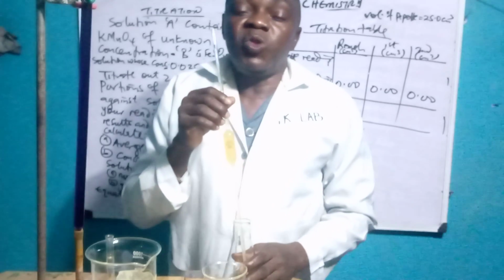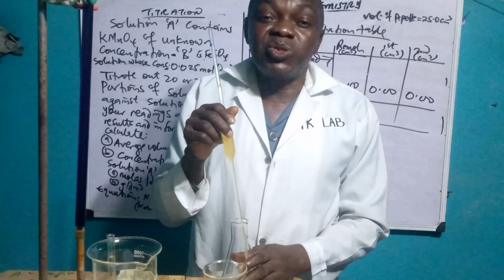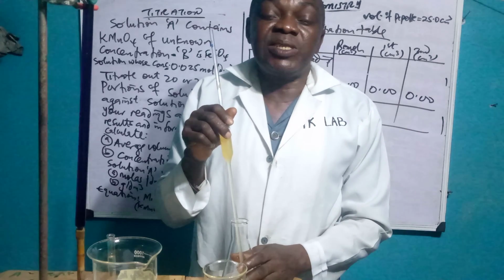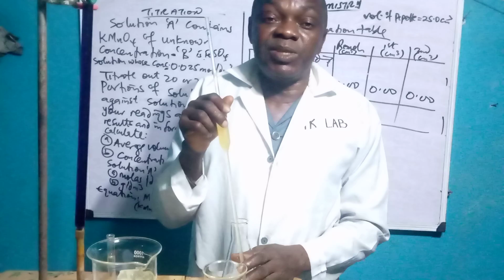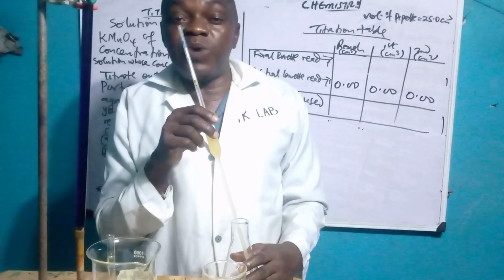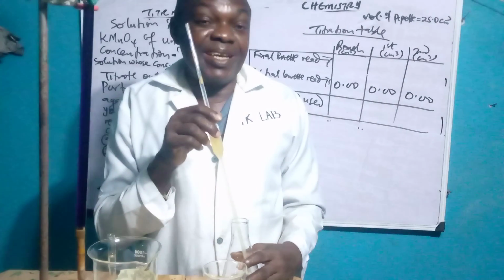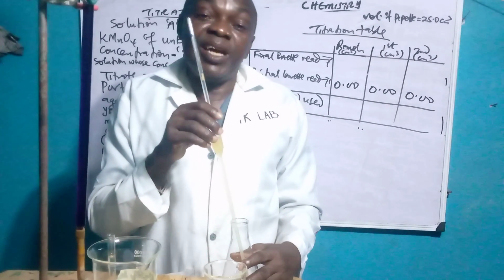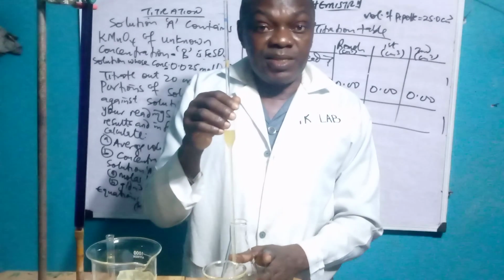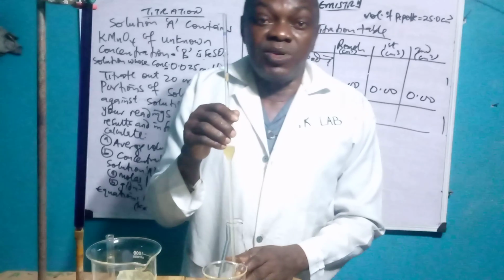Remember, no matter how beautiful the endpoint may look online, you must not use it. Use the one that you are given in your school. The way your teacher explains to you in your school is the one you will use. That's the endpoint. The rest are okay. But for the endpoint, on no condition must you use the one you get online. Even the one I use here, you must not use it. Use the one that is given in your school.